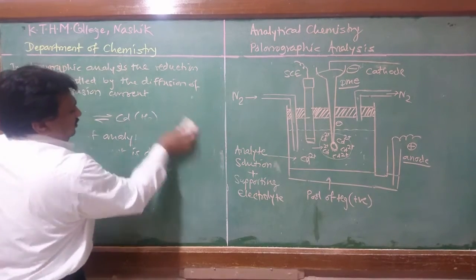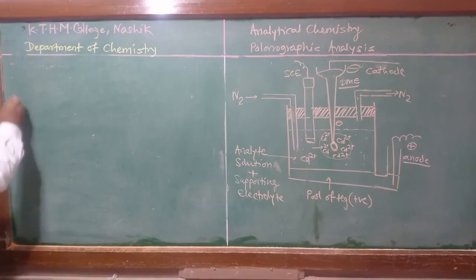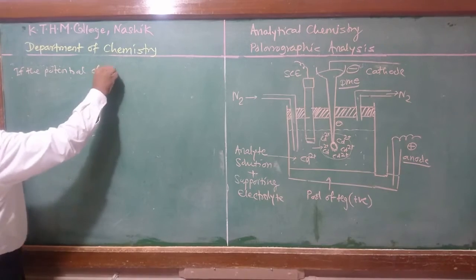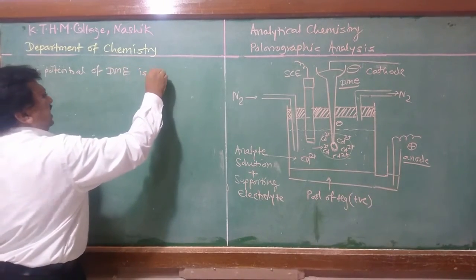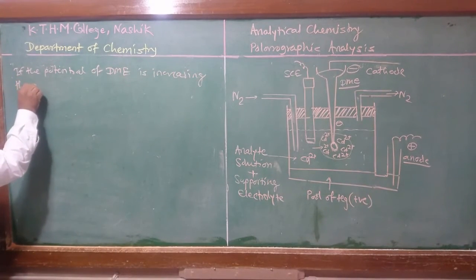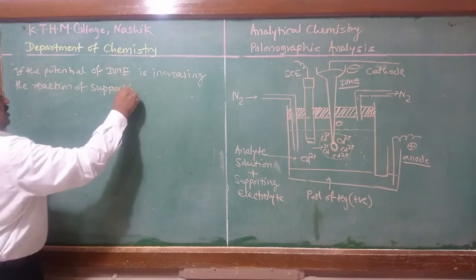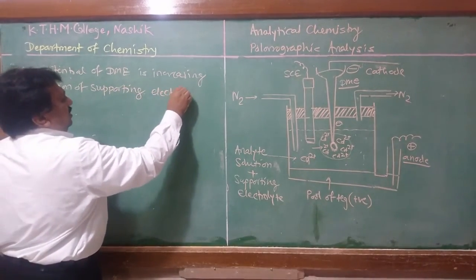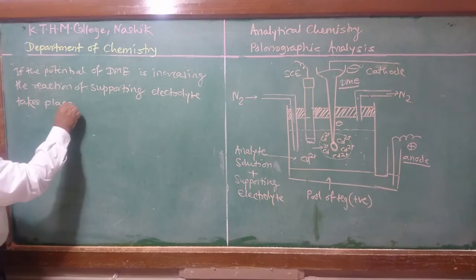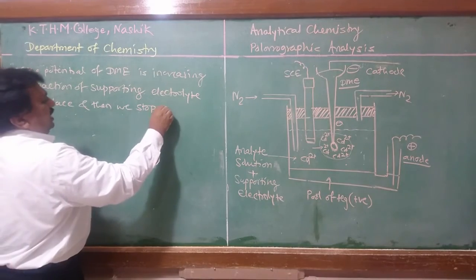If the potential of DME is increasing, then the reaction of supporting electrolyte takes place, and then we stop the analysis.